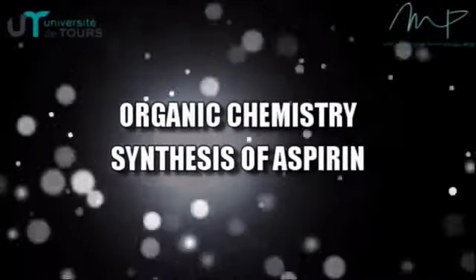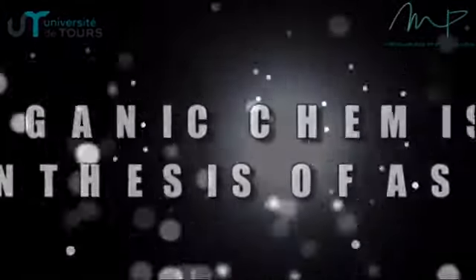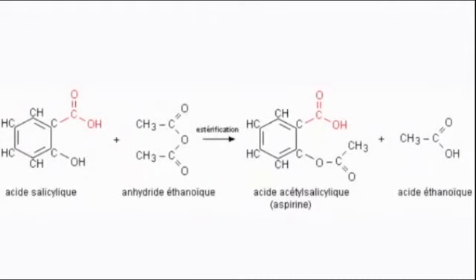Welcome to our organic chemistry practical work. We are second year students in applied physics from the IUT of Blois. We are Audrey and Fanny, and we are going to show you how to synthesize aspirin in a lab. Aspirin is an anti-inflammatory drug used for medical purposes.